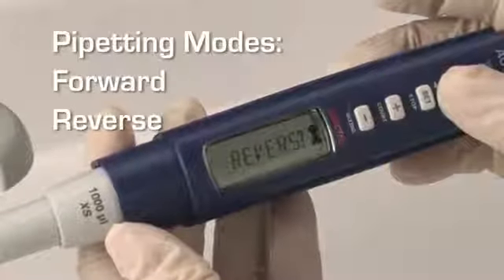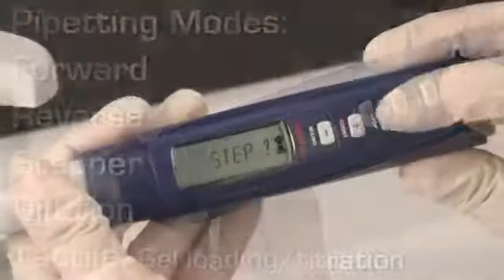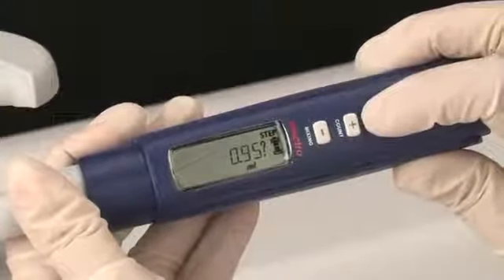There are five different pipetting modes to choose from. Volume is selected using the plus and minus keys. Push the set button to lock in the desired volume measurement.